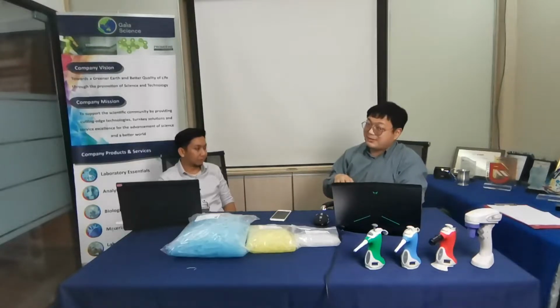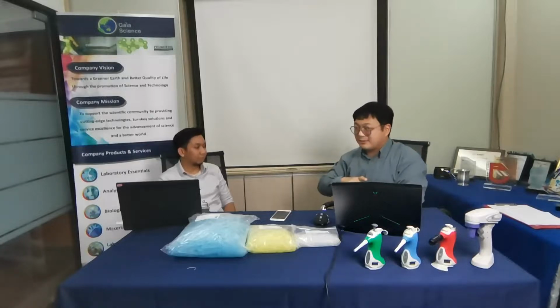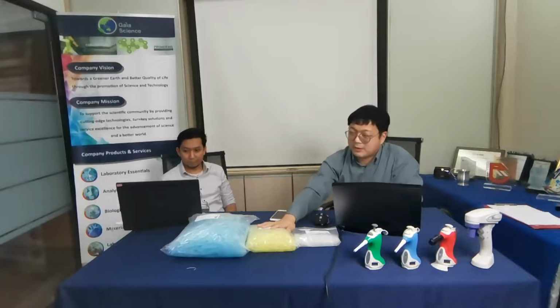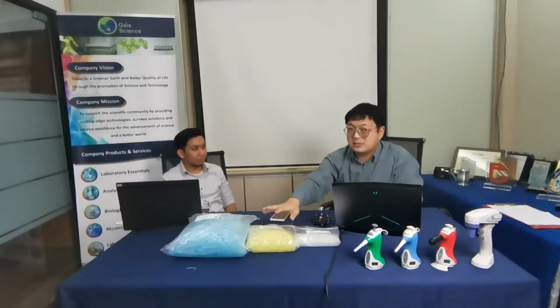Normally, it's best to get 200, because if you use a 100 microliter tip in a 200 pipette, you might accidentally aspirate too much. So it's standard that you get a 200 one. It might not fit perfectly, because I've seen some that only requested 100 for the purpose, but at least with the 200, you are much safer as well. So that's the yellow one.